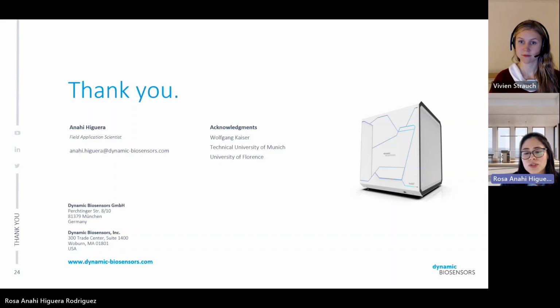And this is because on the tight binder side, we are able to dissociate for very, very long hours, like 12 hours or so. And in the case of very fast binders, we are able to exchange liquids very quickly so that there are no artifacts in the measurement.